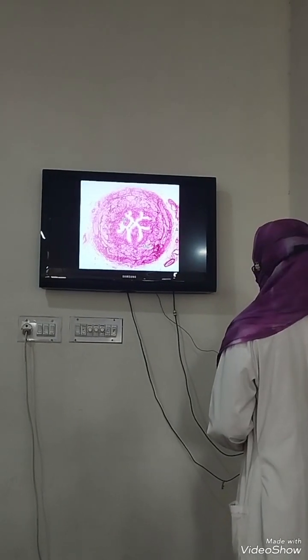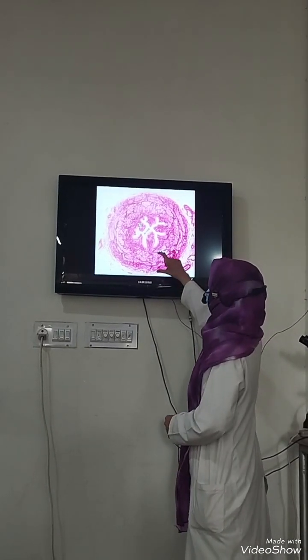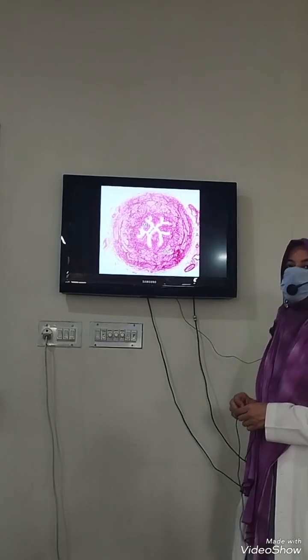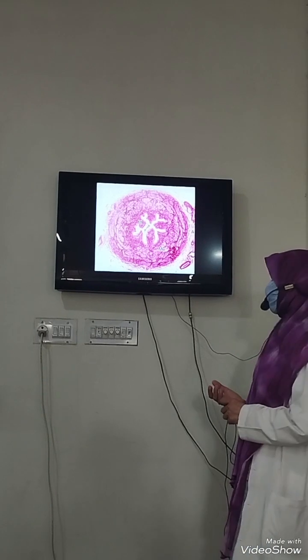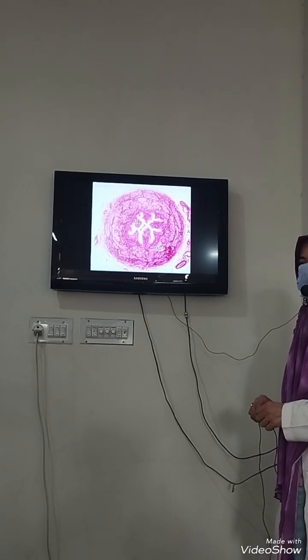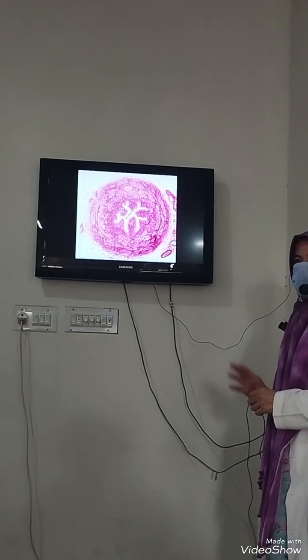Okay, this is the histological section. What striking thing you see? There is a starry lumen, right? Due to the muscular contraction of this muscular tube, right? Okay. After looking into this muscular tube, what differential diagnosis you may carry in your mind? What other tubular structure you have seen so far? Can you name a few? Yeah, rectum is, but it's too big to catch the lumen in it at 4x.